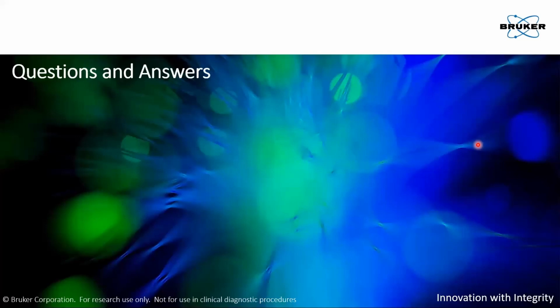And we have time for just one more question right now, and that is, how do you identify unknowns? So the unknown ID is based largely on the annotation quality scoring that I showed. So that's the match with accurate mass, with retention time, with the mSigma, which is a fit of the isotopic abundances, the MS-MS score, and the CCS.